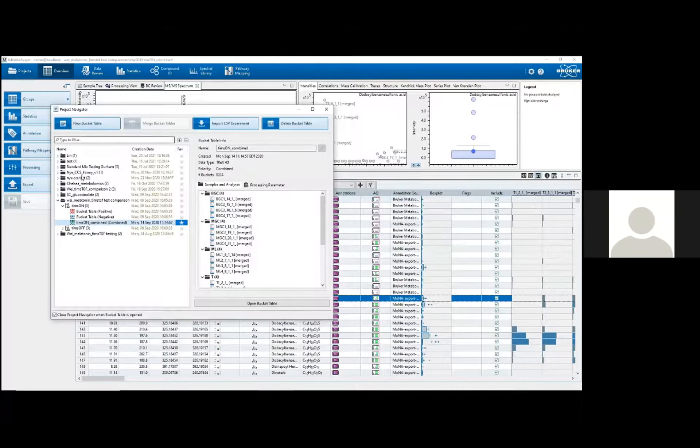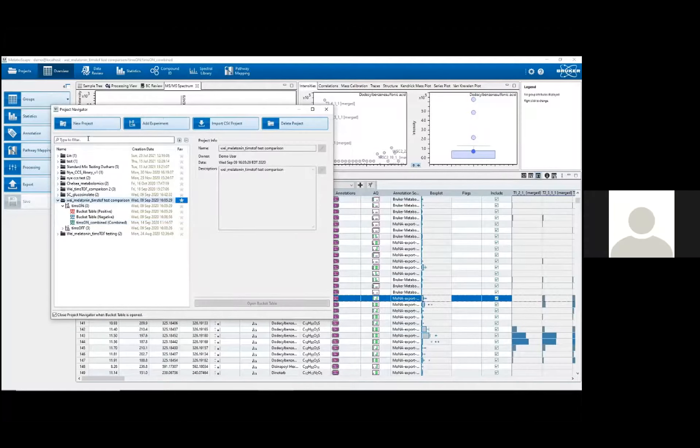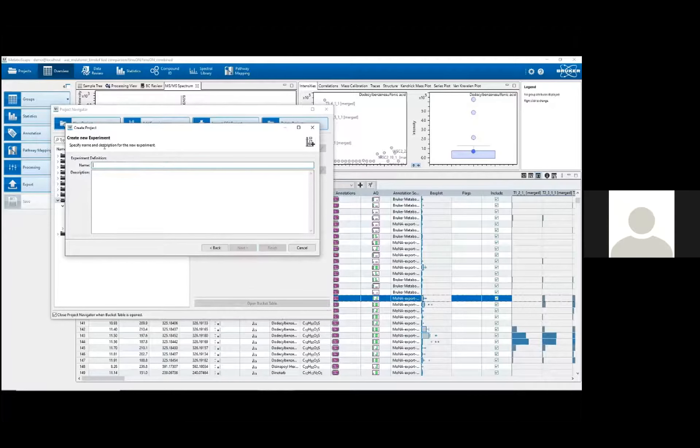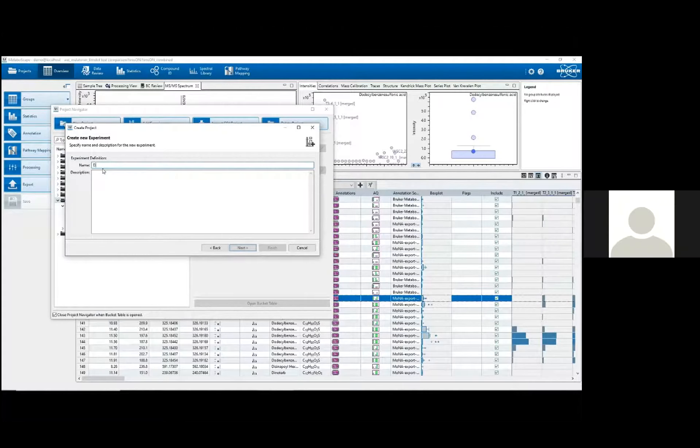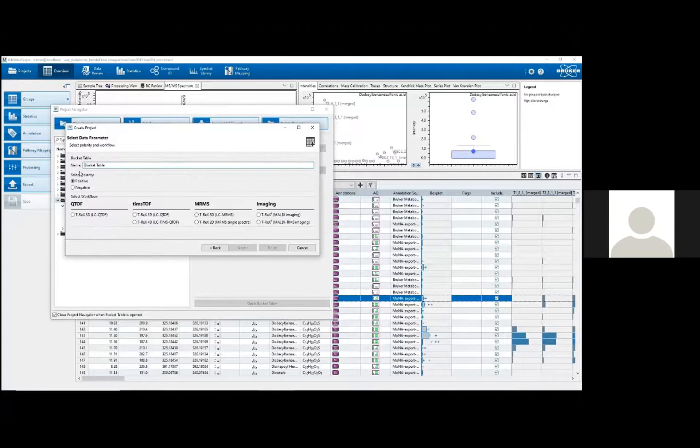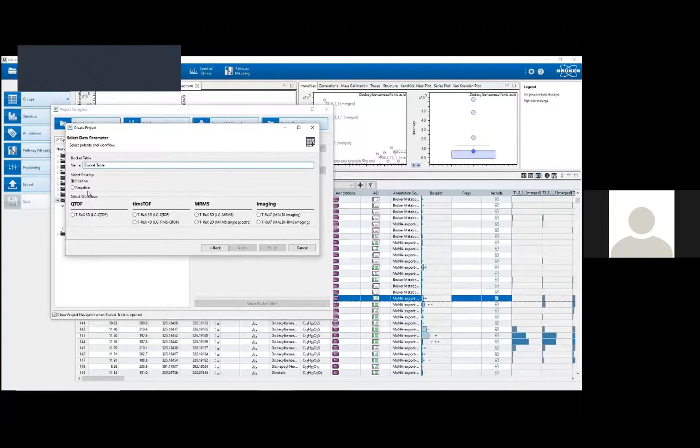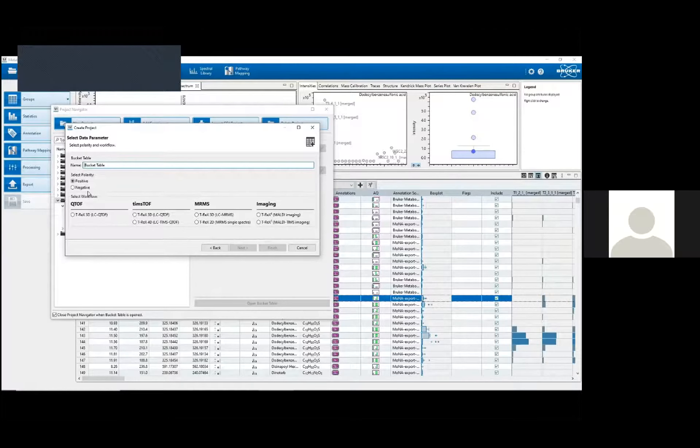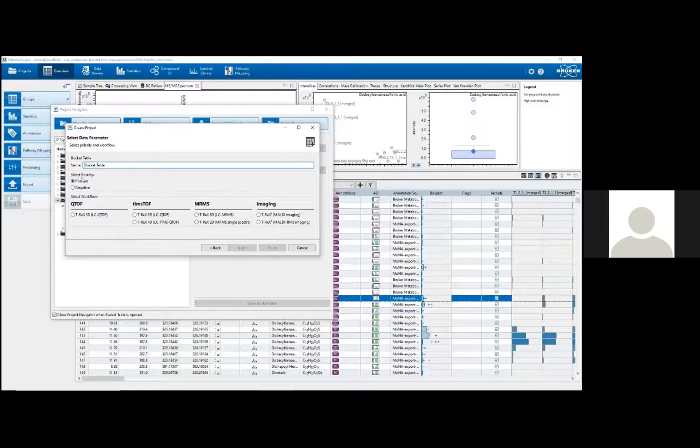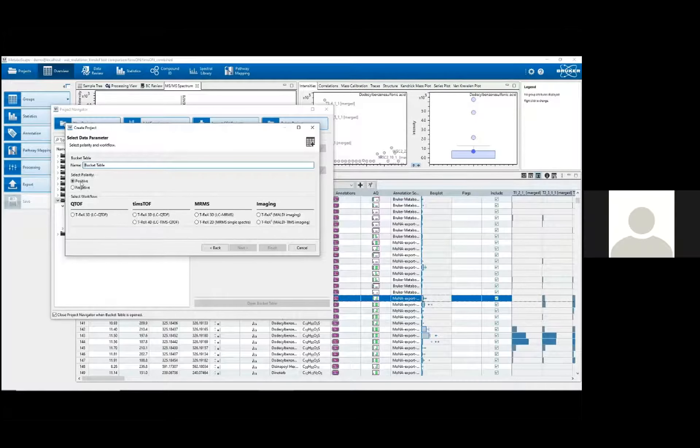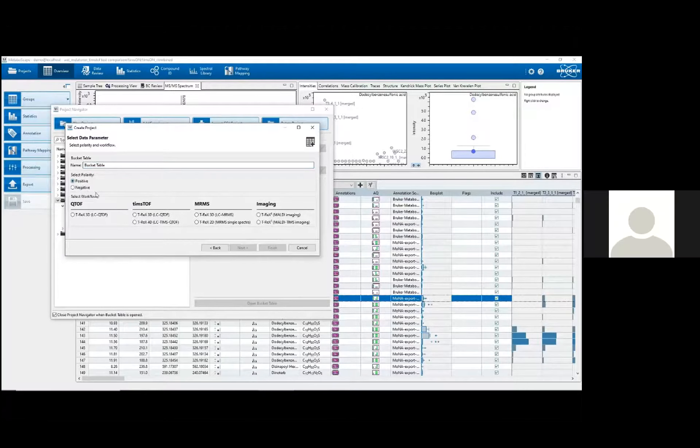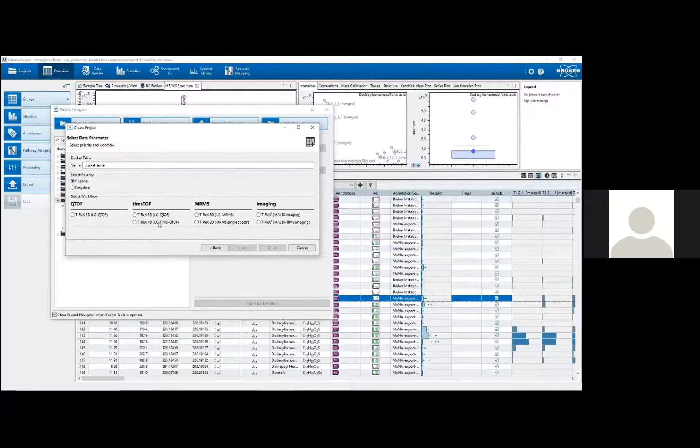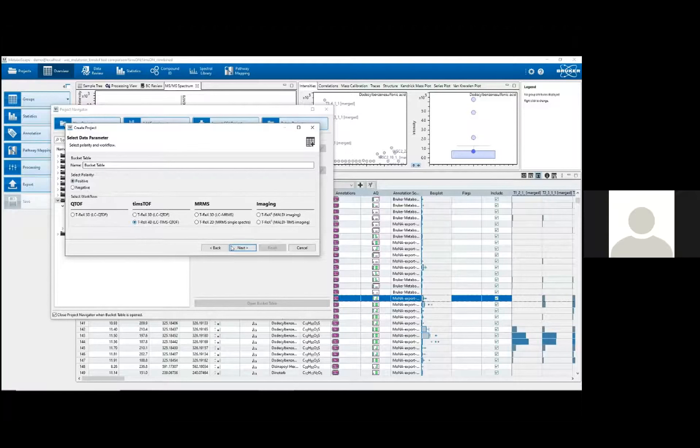First, I can create a new project, which I will call demo, and then within that project you can create experiments. I'll also call this one demo, and then within experiments you can actually import the raw MS data from the mass spectrometer into what's called the bucket table. To do that you have to select the polarity that MS data was collected with, in this case we'll do positive, and then the instrument that the MS data was collected on. We collected this with the Timstof and with TIMS on, so the algorithm used is T-REX 4D.